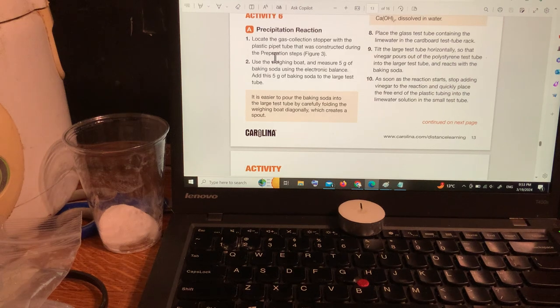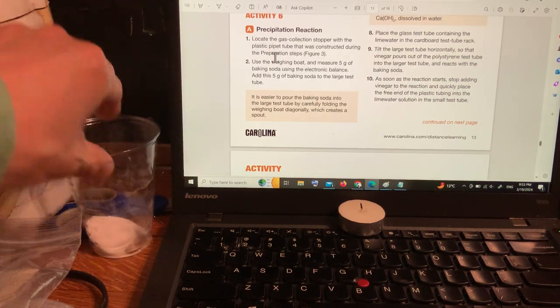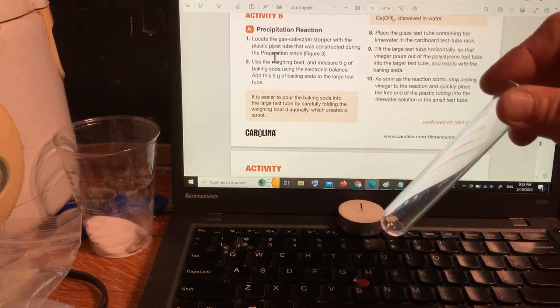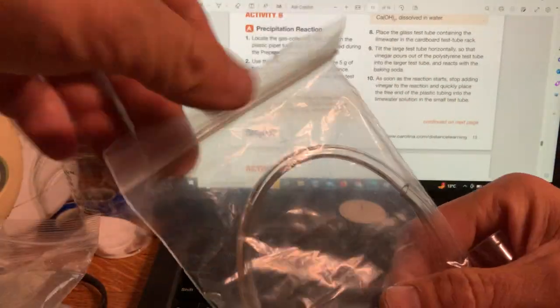Let's do activity 6. Okay, I'm going to actually do this one for reals. So, why? Because it's a bit unusual. Okay, so this is a plastic test tube, right? This is a gas collection stopper.